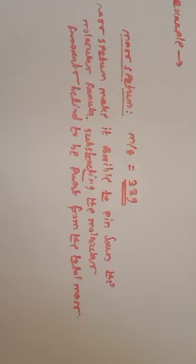And then we subtract the molecular fragments believed to be present. With the help of H1 NMR, we found that one eta 5 C5H5 is present, then two methyl groups, and from IR two carbonyls are present, plus one metal atom.